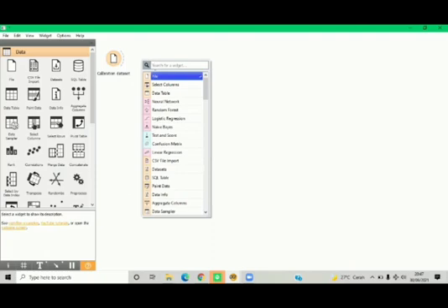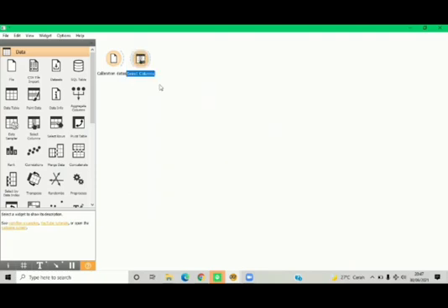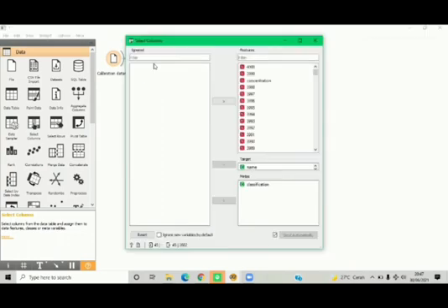In the select columns, we will categorize the data added into the file. So we need to connect the file, the calibration dataset, to the select columns. For the name, we place it in the meta, and the concentration and all the numbers in features.